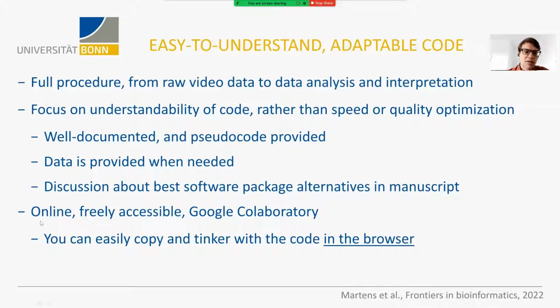Finally, all of this code is available in multiple formats. Most importantly, it's available online, freely accessible on Google Colaboratory, which means that this is Python code that you can easily copy and tinker with in the browser itself. So you don't need to install any code bases, any software, anything. You can just run it directly from the browser.